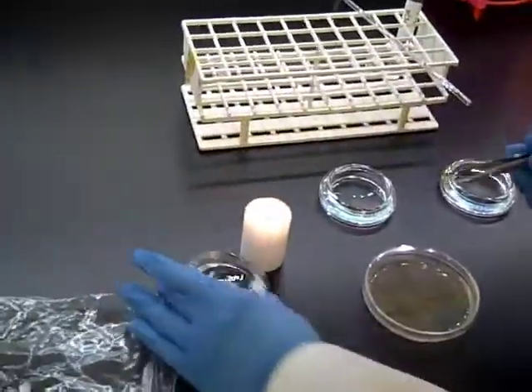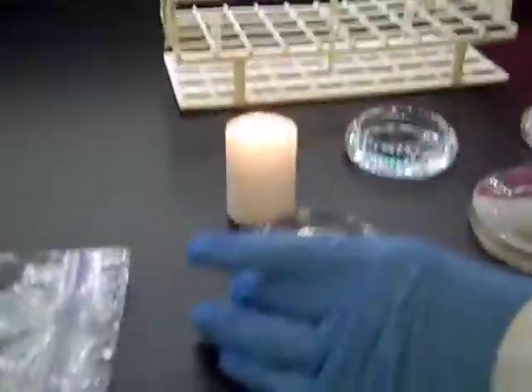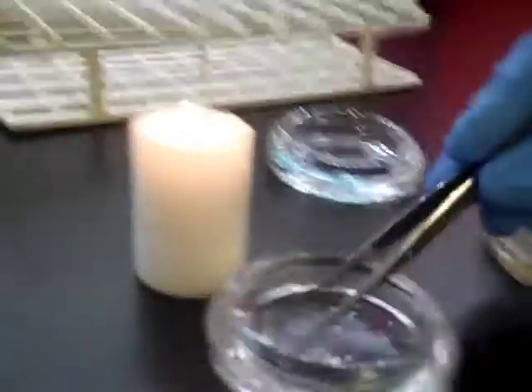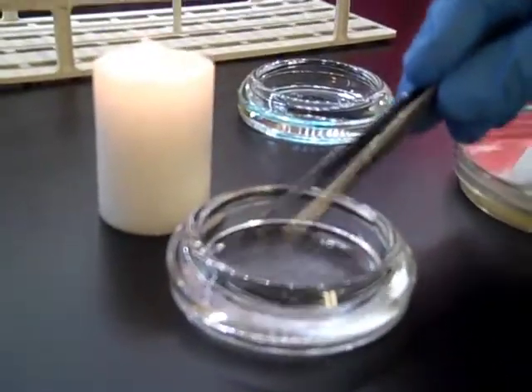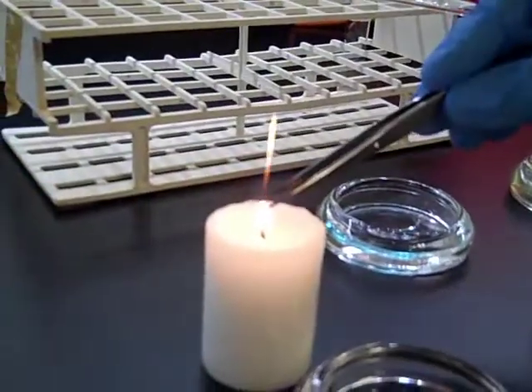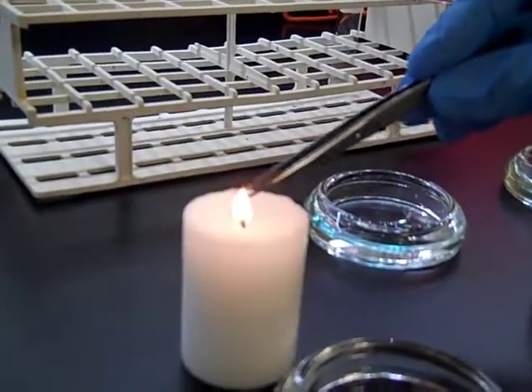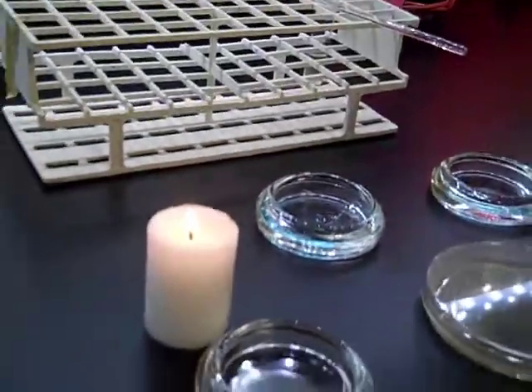First, you're going to flame sterilize your tweezers. You're going to need to use tweezers from home, just like when we sterilized the spreader in Lab 3. Take it, knock off any excess alcohol, and flame it. Let it cool for a few minutes.